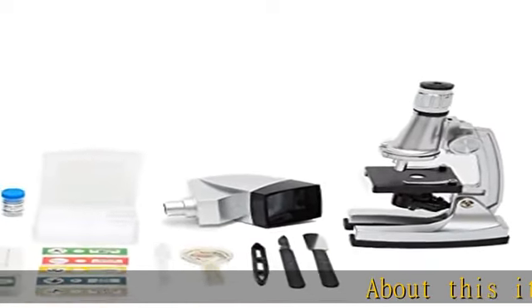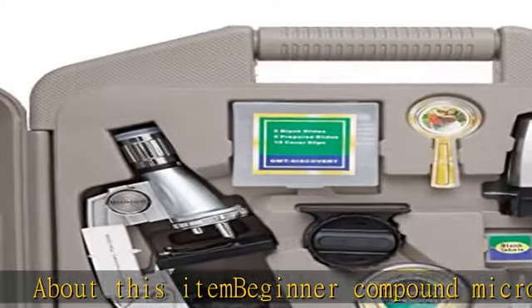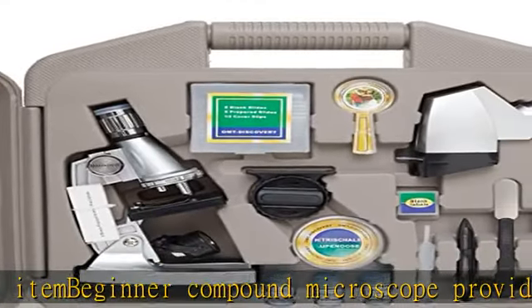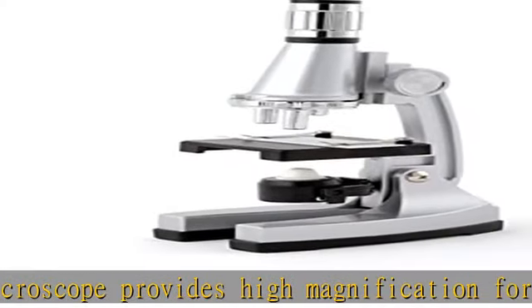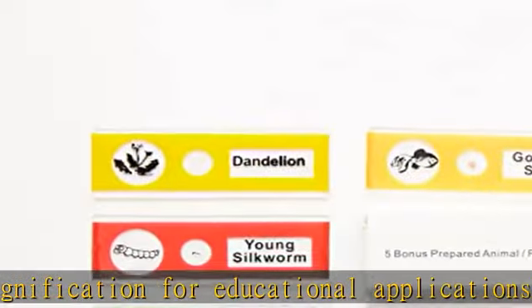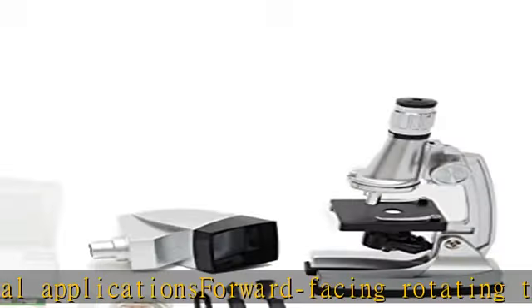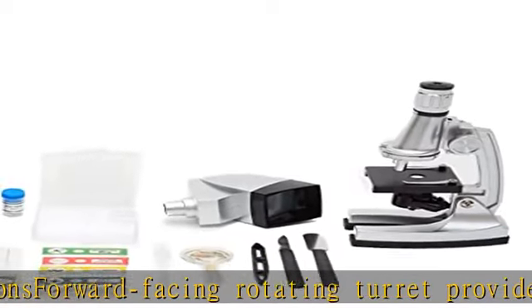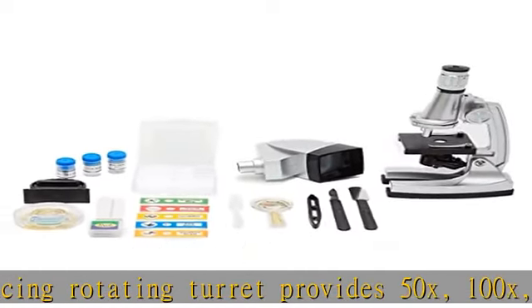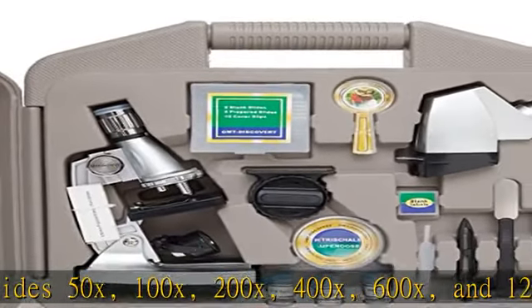About this item: beginner compound microscope provides high magnification for educational applications. Forward-facing rotating turret provides 50x, 100x, 200x, 400x, 600x, and 1200x magnification for educational applications and exploration. Coaxial coarse focus has a rack and pinion focus mechanism on a durable and stain-resistant plastic body. Comes with a 37-piece accessory kit and hard-sided plastic ABS case.